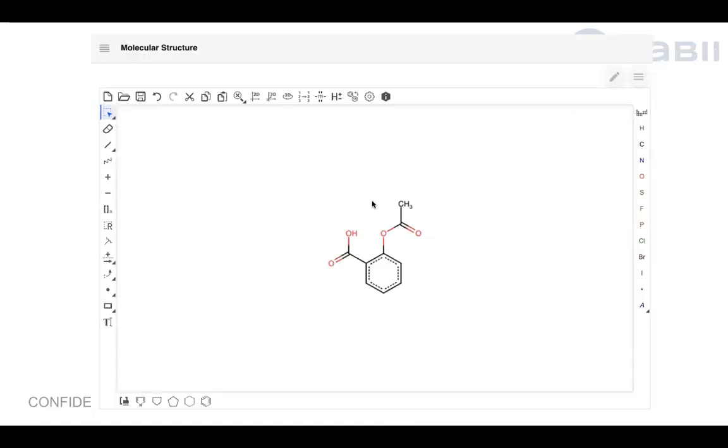And then in the section, you are able to see there's a molecular structure function, which means you can draw whatever kind of molecular structure. And we also support the substructure search and the similarity search of the structure directly inside the system. So that's the second usage.